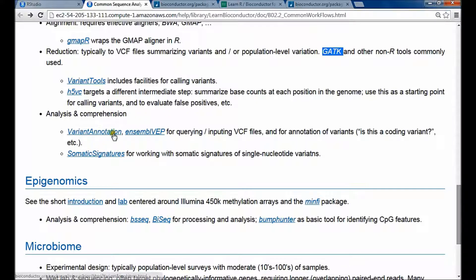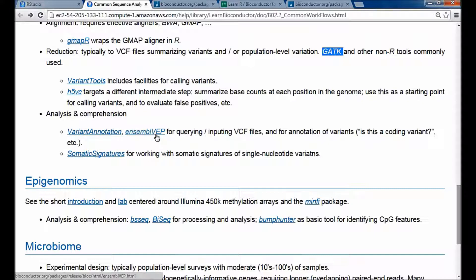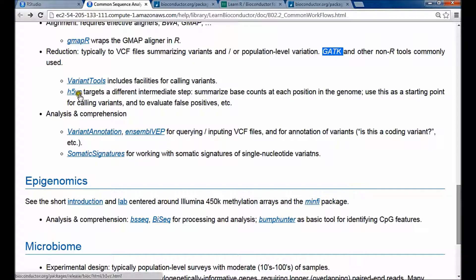You can also take the variants and send them to Ensembl's Variant Effect Predictor, which has a more elaborate set of effects that can be used to annotate discovered variants. There's also an interesting package called Somatic Signatures, which builds on H5VC and looks for somatic signatures of single nucleotide variants.